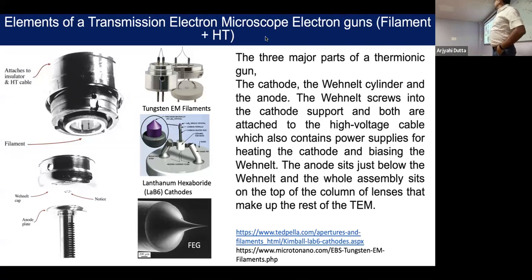No. That coherency does not only depend on that, because look, one thing is that definitely your filament, how this filament is behaving and how you are extracting that electron. So if electron is coming from that, definitely it will be helpful. But there are some other parameters also involved. And whatever aberration you are talking about, those are also involved in your resolution part. So this is one of the parts involved for your coherency, that if you heat less, your tip will be very sharp and it will be much easier to get a coherent electron beam. And it may affect in the later stage also, right?